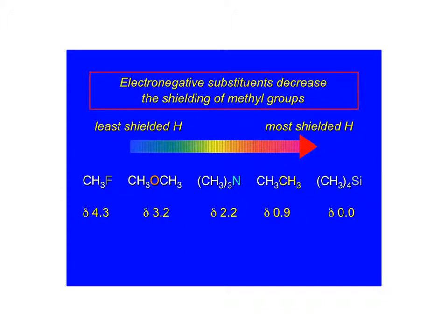So this hopefully would make sense. The more electronegative environment that hydrogen is in, the less shielding it has around it. So that's why if you look here at the fluorine, it is the most of the halogen.